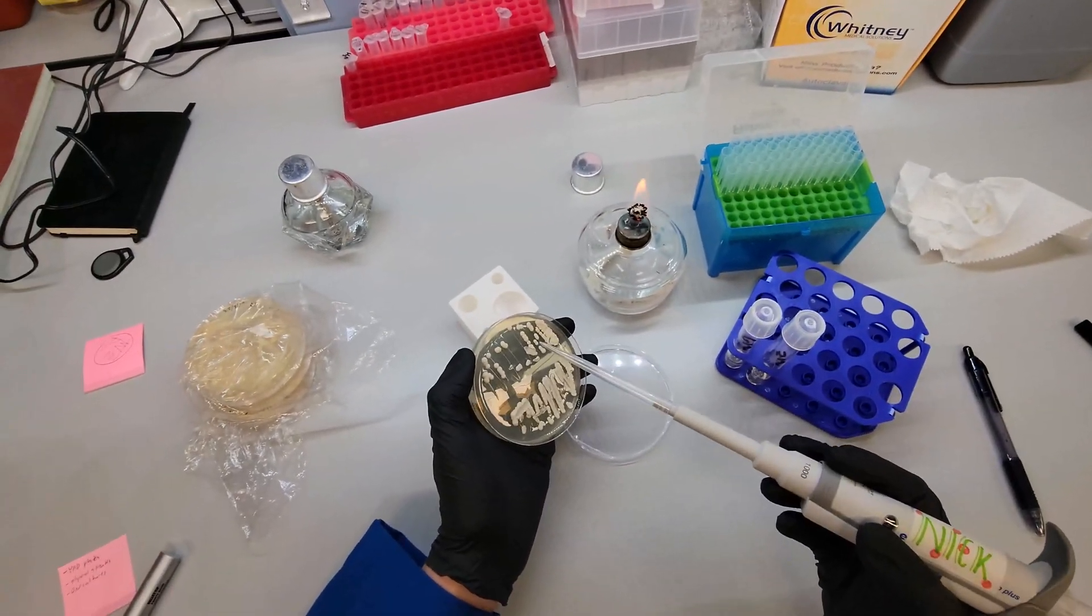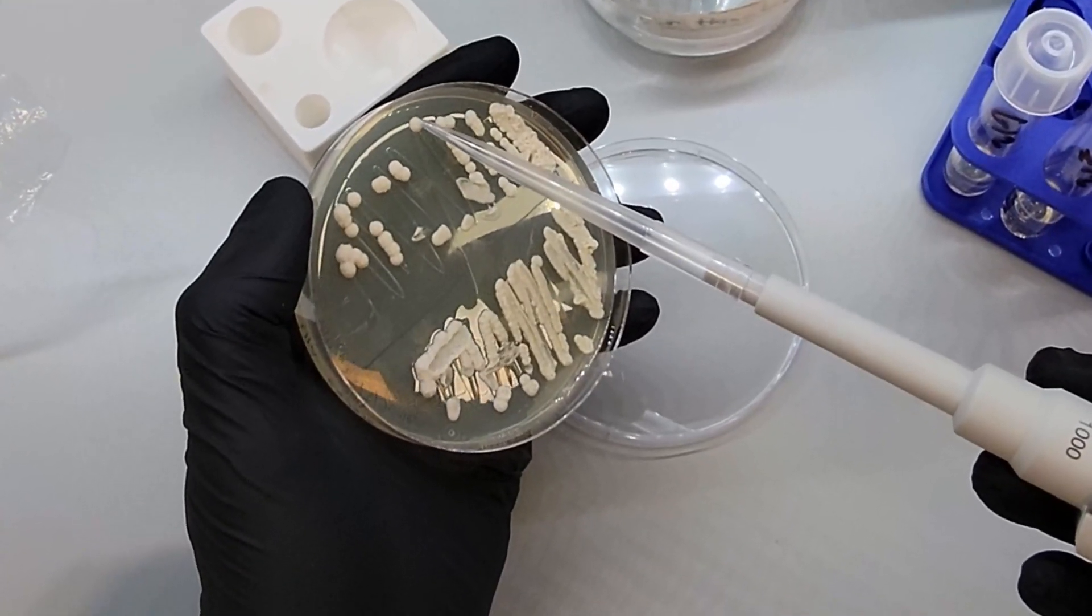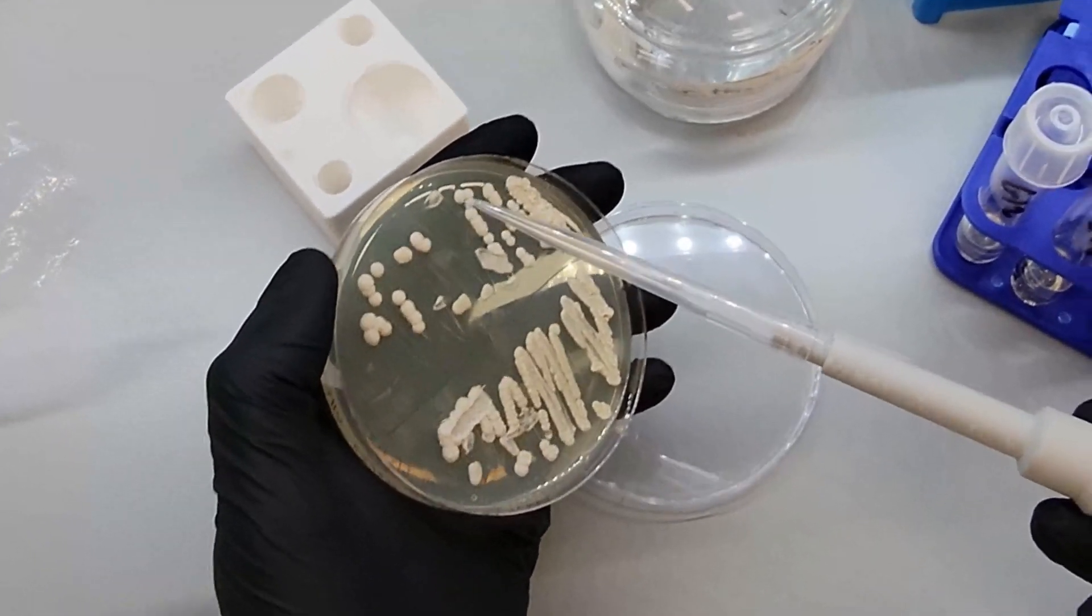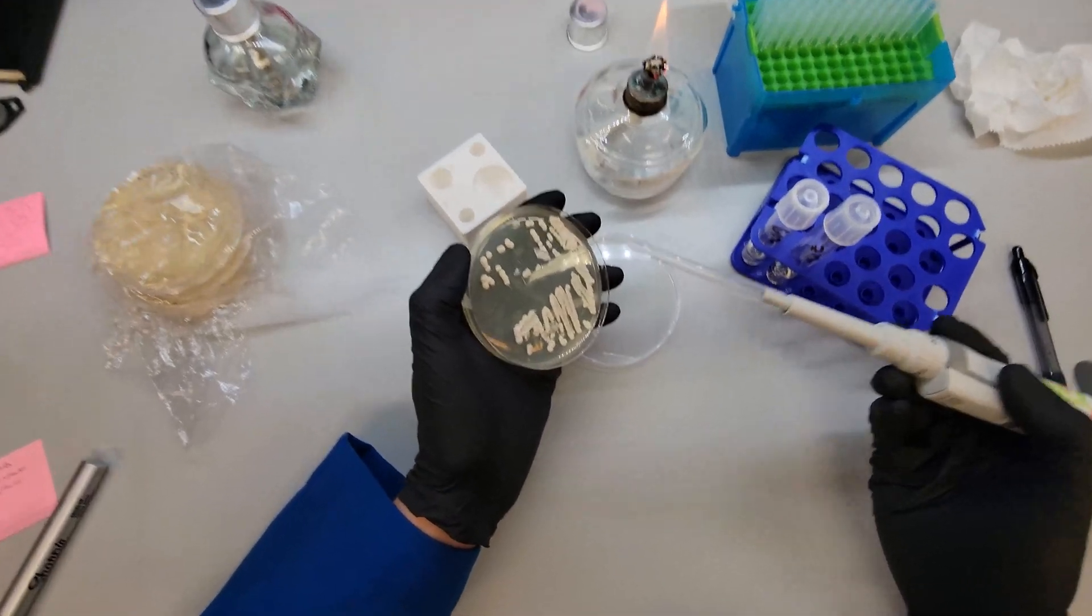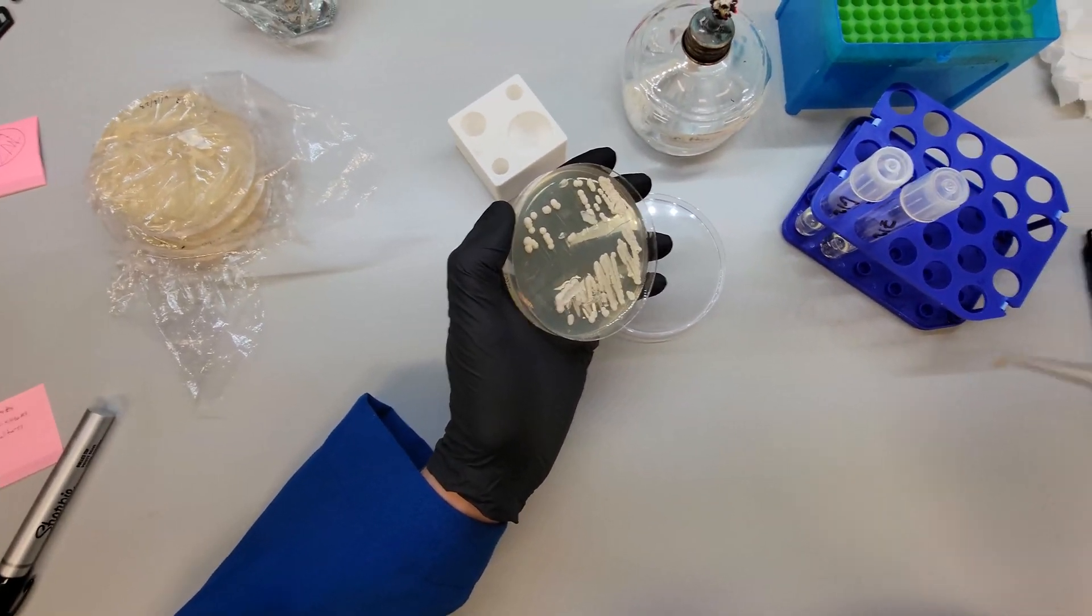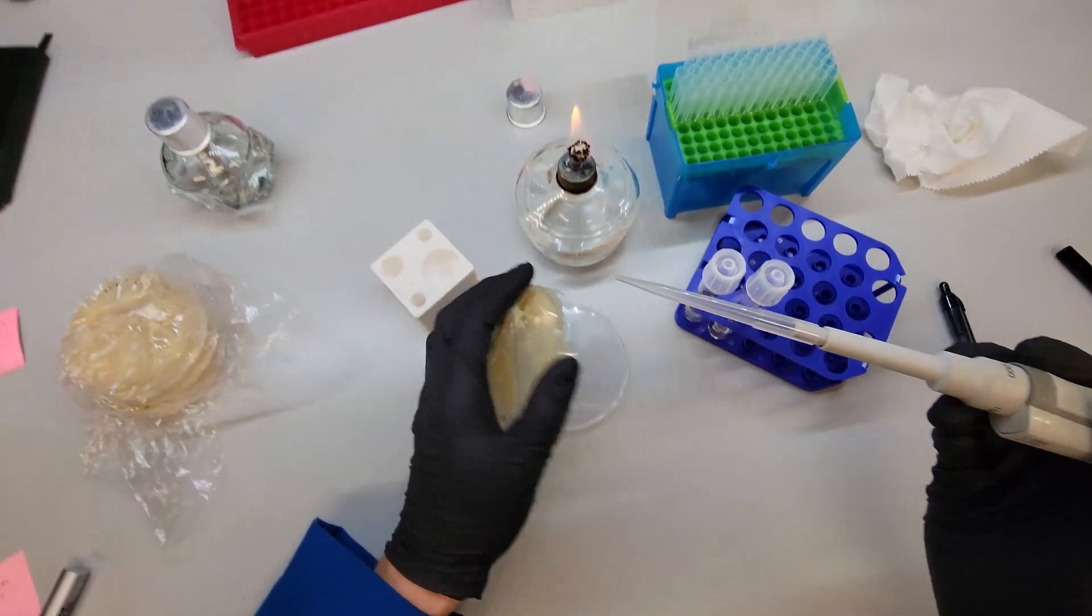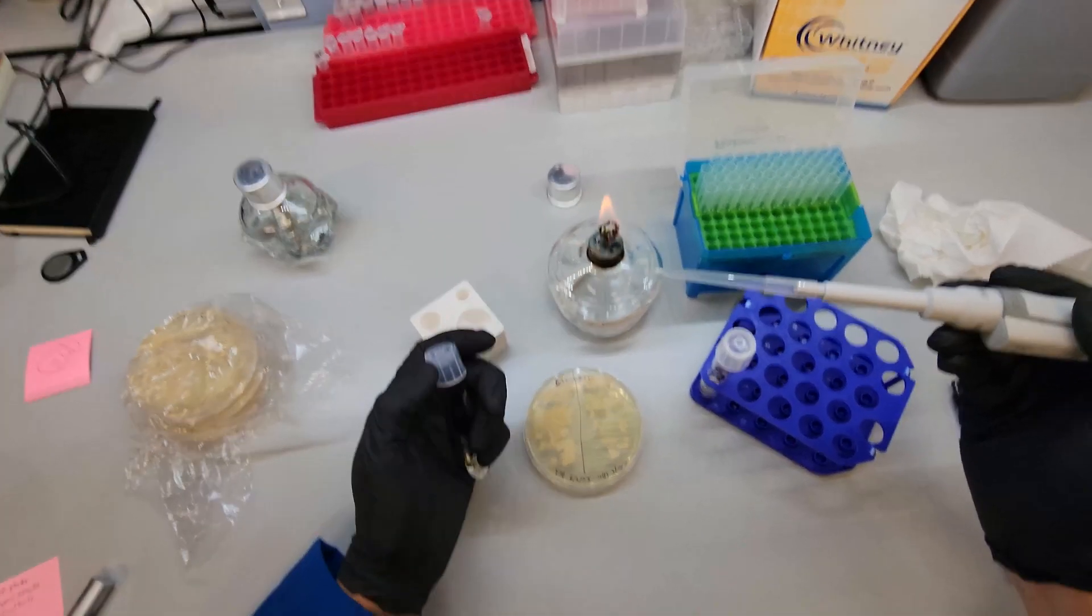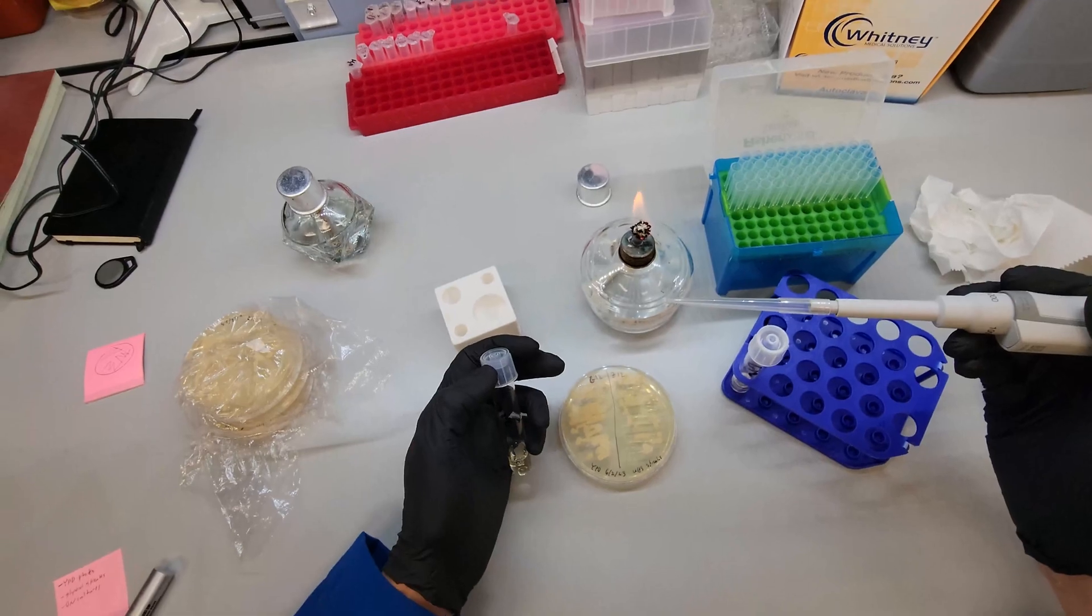So you can see there's a bunch of individual colonies. Every time we start an overnight culture, we want to at least try our best to get an individual colony, to get some cells from an individual colony. Do you need to get this massive clump of cells? No. Do you need to get as much as I have here? No. This is still a lot. You can get a tiny, tiny, tiny amount, especially if you're working with E. coli or something. You can get an amount of cells that's basically invisible and still inoculate the culture.